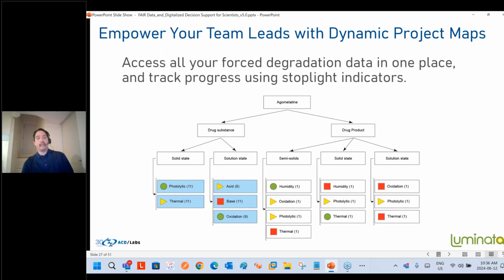So with that blue rectangle highlighted there in this side of the image, you'll note that these are the 5 studies that have a particular degradant. How much time does that save? Especially for end users and project teams that need these numbers right away and need to understand what's been occurring within that whole study application.